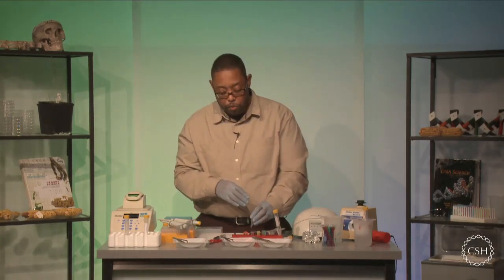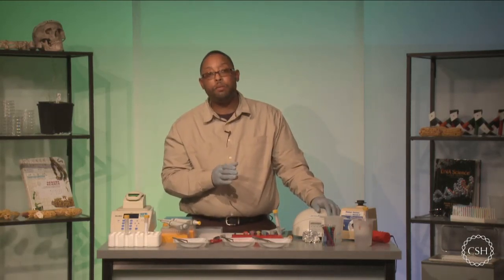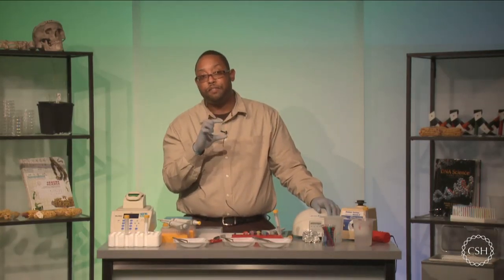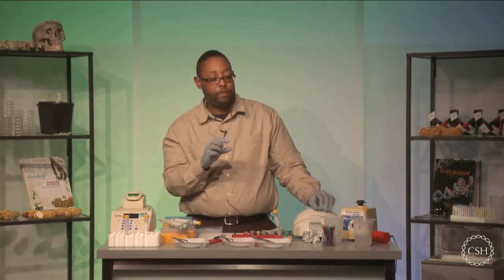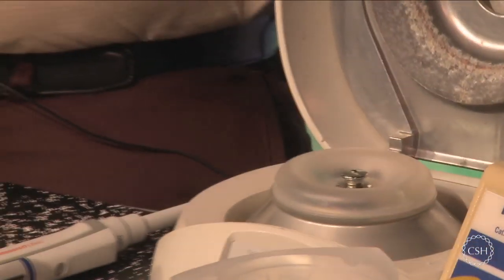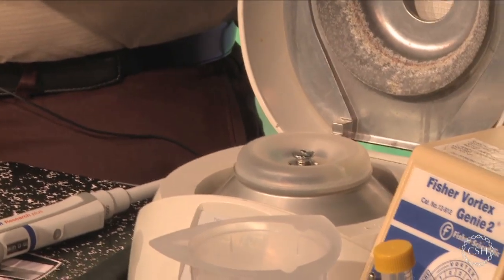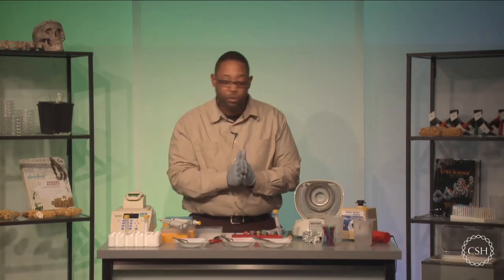Now once all of the debris is at the bottom of the test tube, we're then going to be able to extract the supernatant, which is actually physically on top, and that's what we want. The rest of the test tube is actually ready for the trash bin. If you're worried that you might make a mistake along the way, always keep the remaining portion of the supernatant, because the simple fact is that if you lose the first set, you'll always have a backup because we're only going to use half of it.